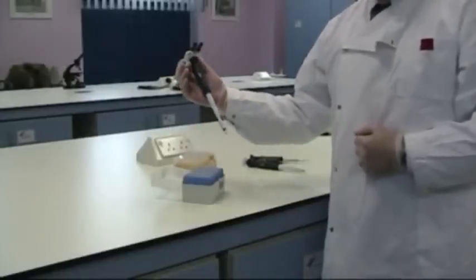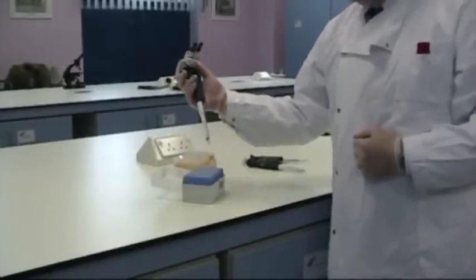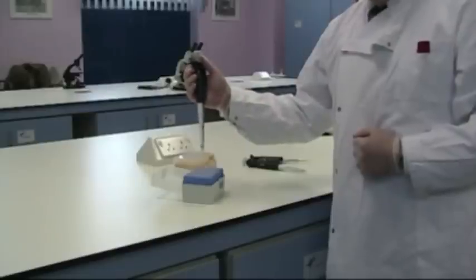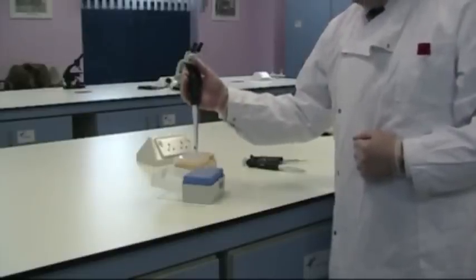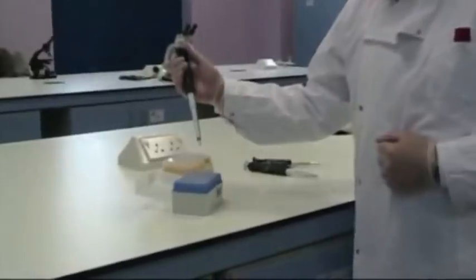These are micropipettes, often referred to as Gilsons as a trade name, and these are extremely accurate, but they're also very sensitive and very expensive, so care needs to be taken when using these.